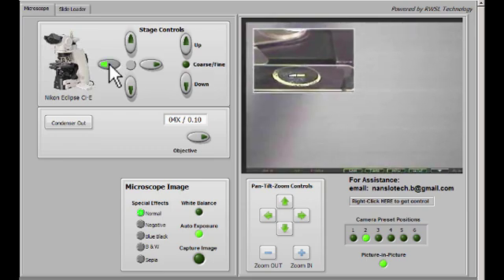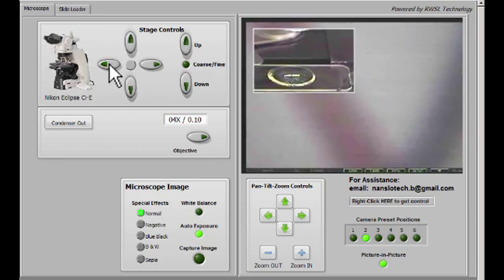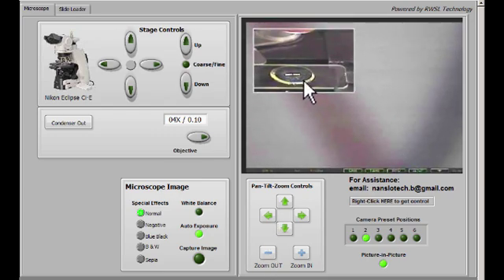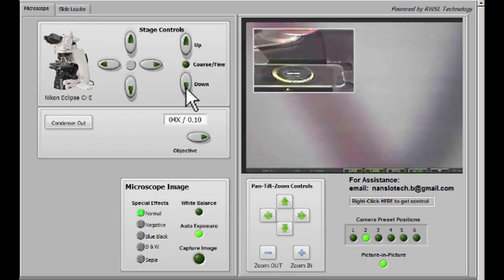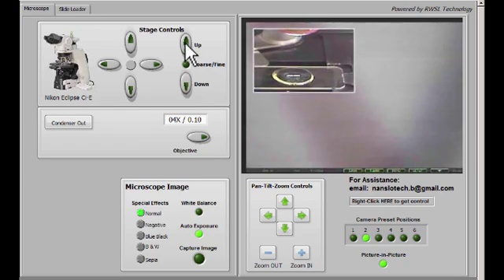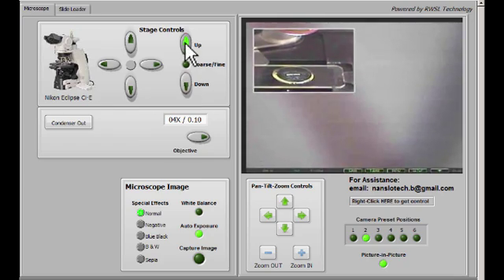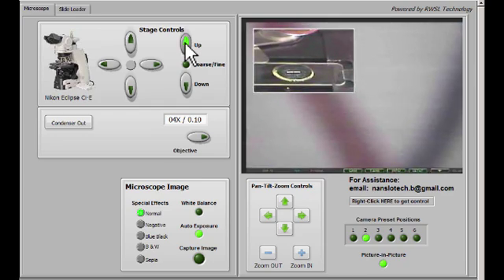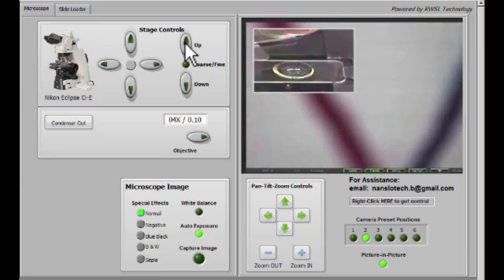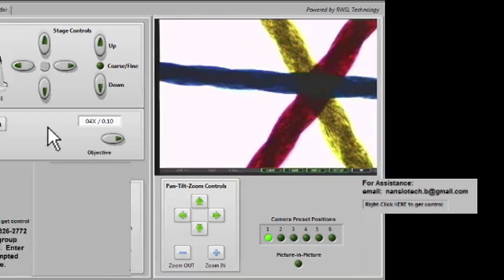As we continue moving the slide, we can see that the subject is now underneath the objective, and we can start to focus on that subject and look at what we're supposed to look at. Use the up and down arrows to focus, and you can change the focus control from coarse to fine by clicking on the button in between the up and down buttons.